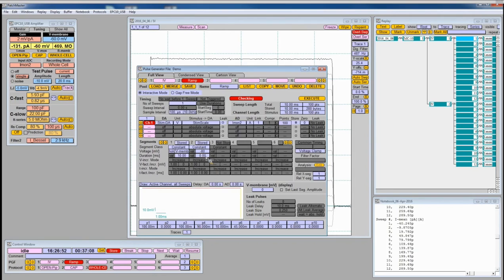After this step to minus 80 millivolts, now comes the ramp. Again, stored enables the segment. It's not a constant where it should go to, it's a ramp. And the ramp value from where it should go to, let's say it's 100 millivolts. And the length of the ramp, let's say 200 milliseconds.